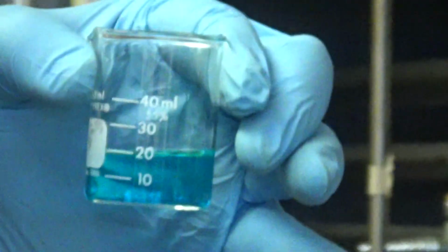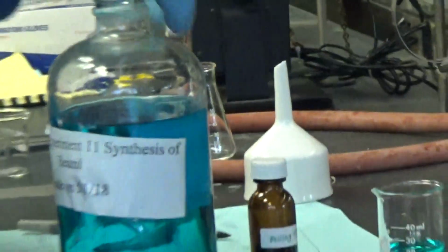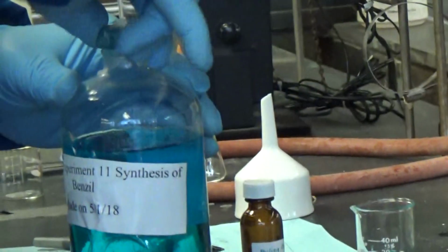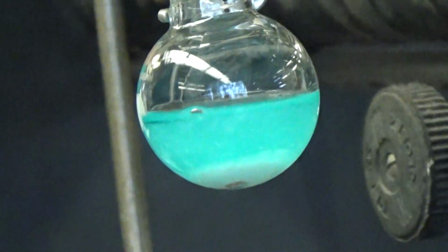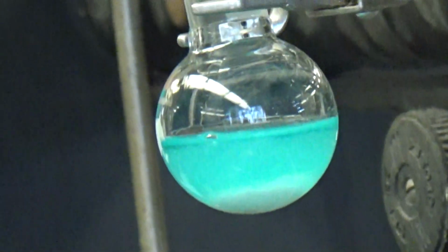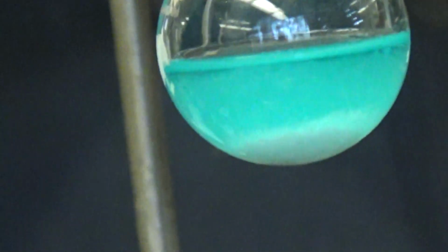It's exactly 20 milliliters. It's kind of blue because of the copper. Copper acetate is probably also a little toxic. I think all the copper salts are sort of toxic. It looks like Kool-Aid.